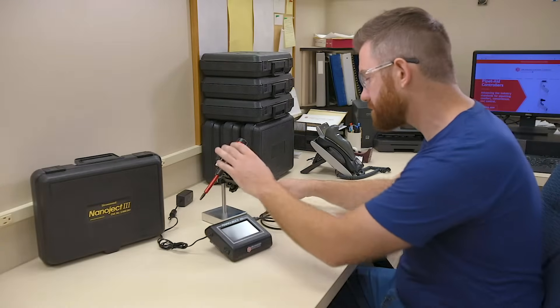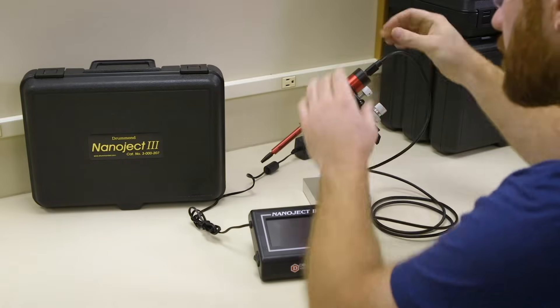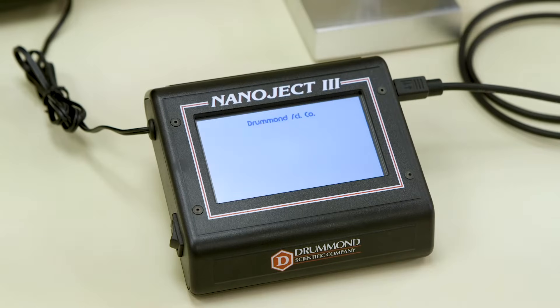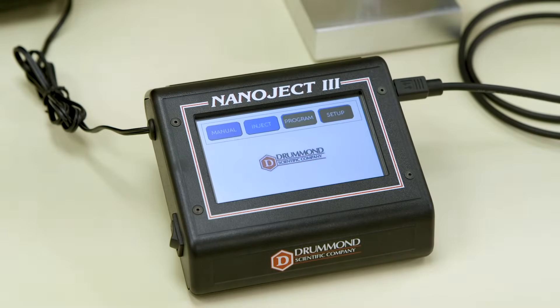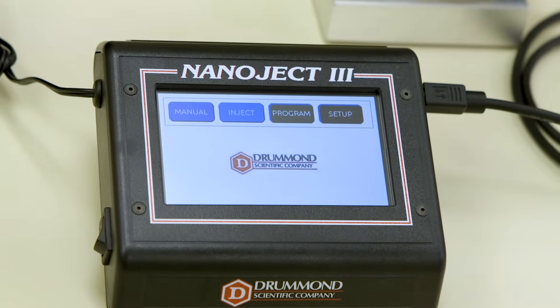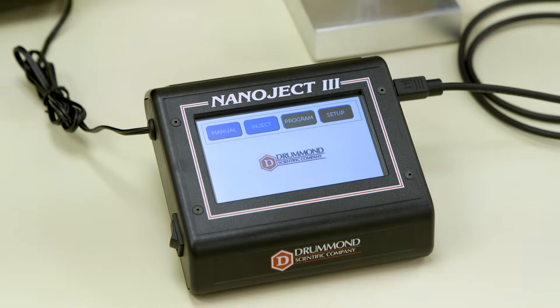Once you've connected the injector head to the control box, plug in the unit and power it on. You will see four menus: Manual, Inject, Program, and Setup.